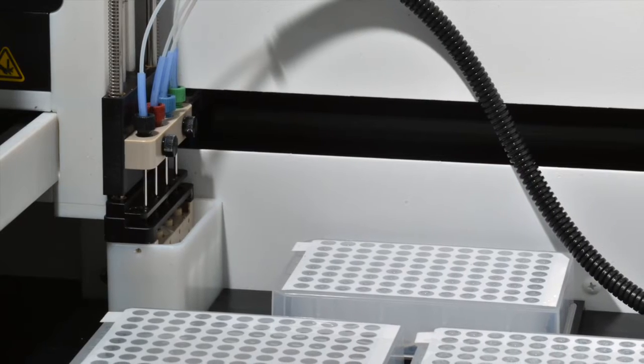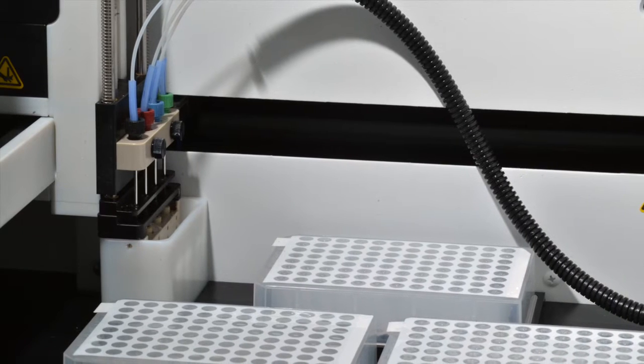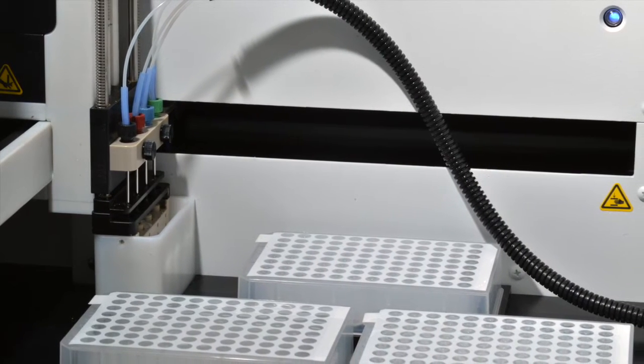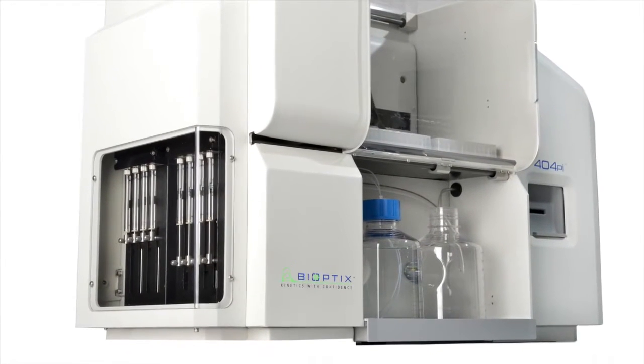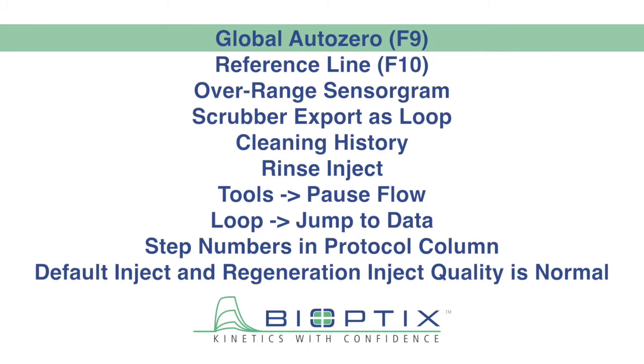In this video, we're pleased to present to you some updated software features, all of which are designed to enhance your experience using the software for our 404 PI instrument. Let's start with the Global Auto Zero feature.